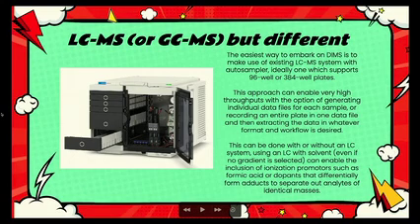The benefit of going back to using an LC system, but without doing conventional actual LC, is you don't have to worry about column selection. You don't necessarily have to worry about getting the gradient correct and getting good separation. And by including a little bit of solvent from a chromatography pump, from a binary or a quaternary pump, for instance, you can put in some of the ionization promoters, so you can pop in a little bit of formic acid, acetic acid, those types of things.